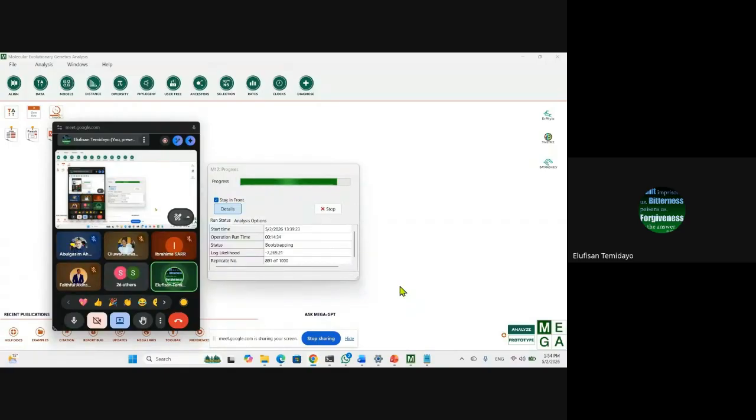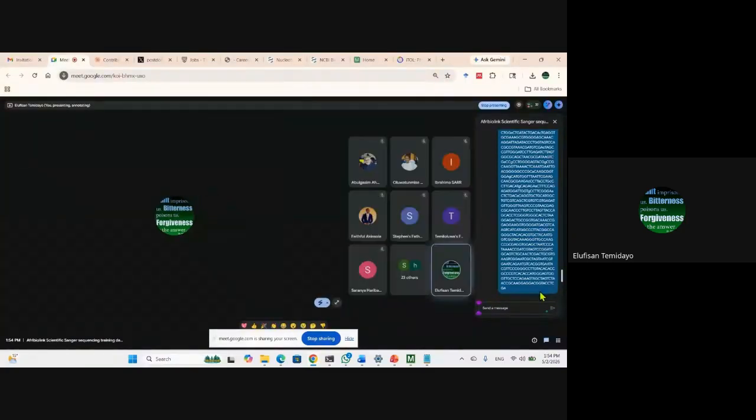Then we can move to submitting our sequence. Let's see what this one will have for us. So while we're waiting for that, if there's any question for me, you can just give it to me in the chat so I can respond to them.